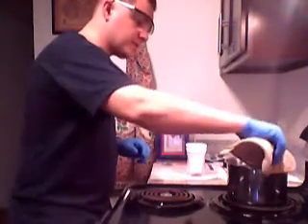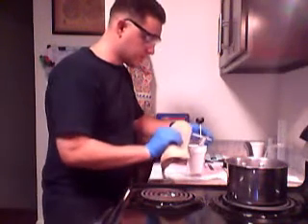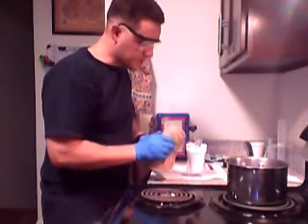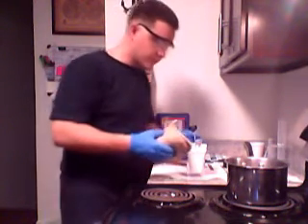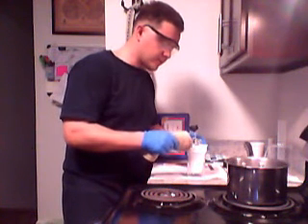Set. Now carefully, without burning myself here, pull this piece of metal up. Immediately stick it in there. Make sure it doesn't touch the actual thermometer itself, which it's not, and I'm going to go ahead and start my timer right away. Okay. What I'm going to do here is take off the tongs and make it a little bit easier for myself.